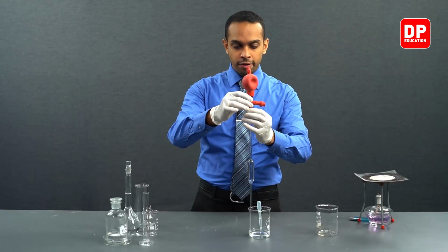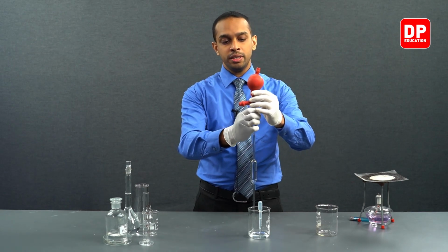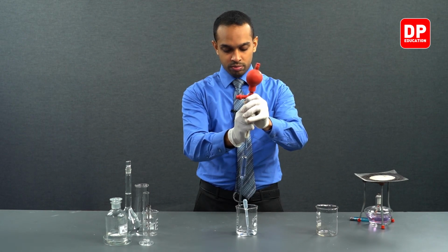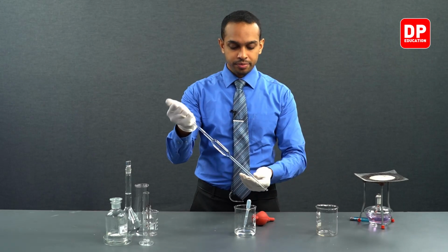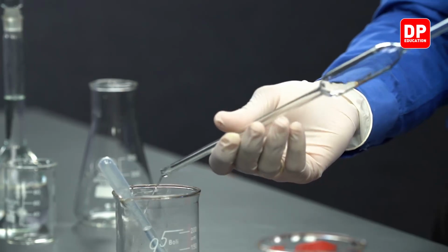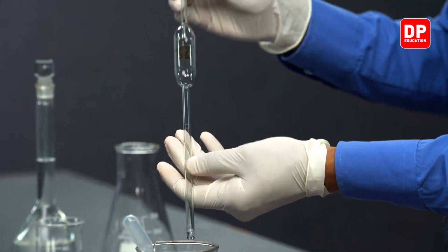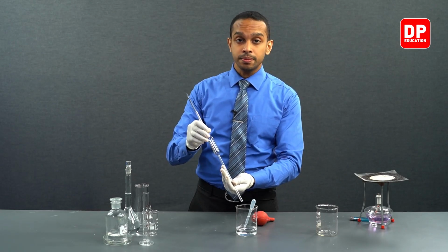Now, after you have taken in a sufficient amount of water into the pipette, we can remove the pipette filler like this, and then we can turn it around and let the water go. After a while, we can let the water go out of the opening of the pipette.